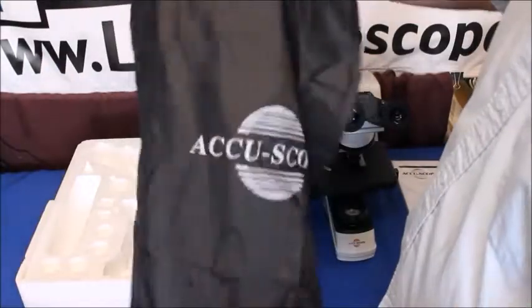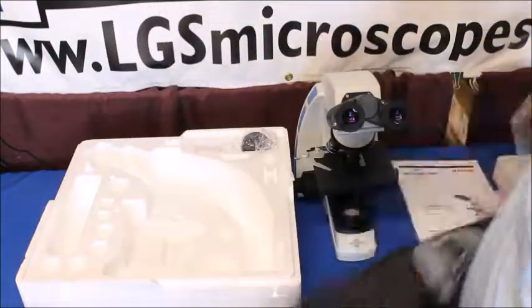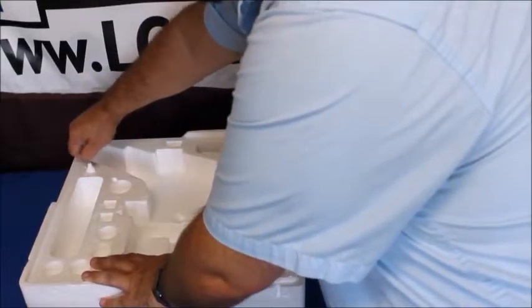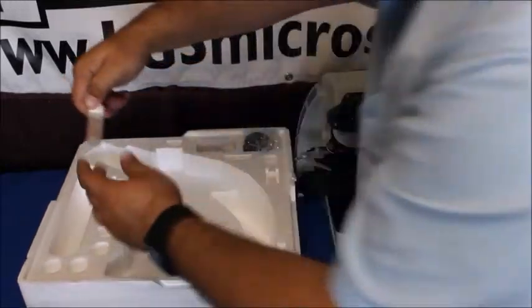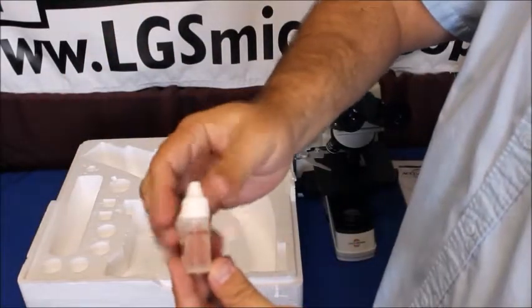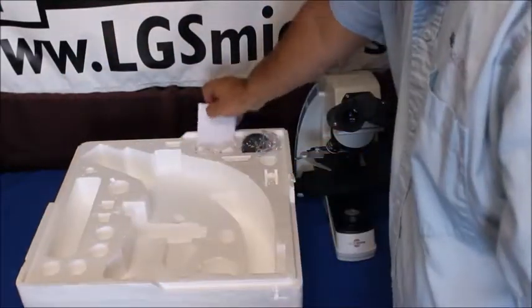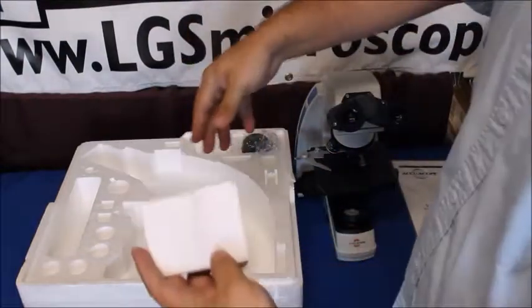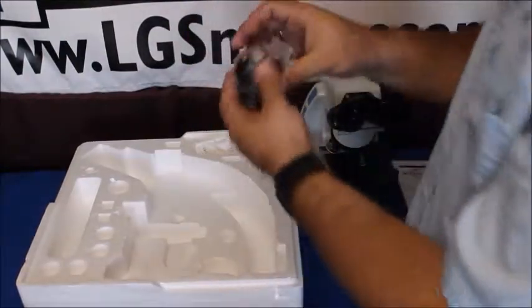This microscope is made by AccuScope so you'll get a cover with their logo on it. Over here we have some immersion oil that you'll need for your 100x objective. Here's some lens paper and your condenser.